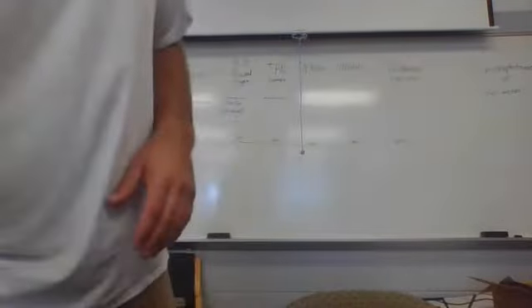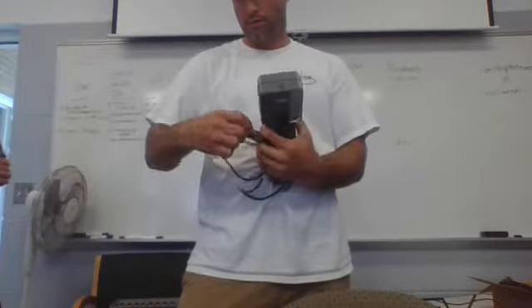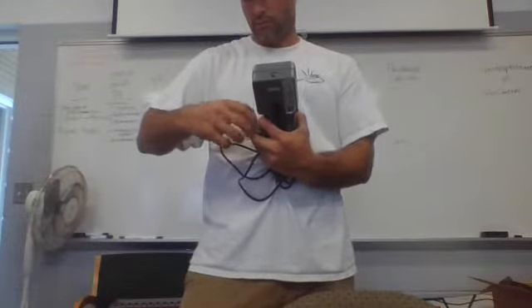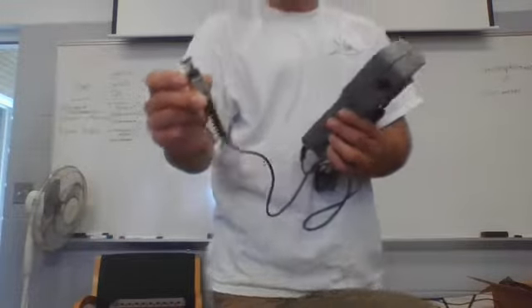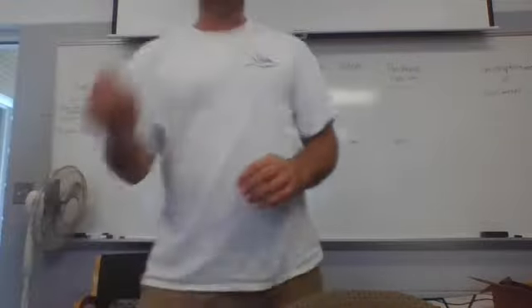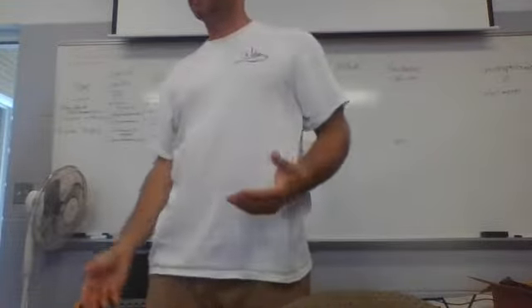This is an example of a newer model that has, under here, you put the solution, and then you stretch that membrane across it, and this is a little O-ring that holds it in place. So you can pass that around if you want. At some point I'll make you change the membrane, drive you crazy. Because if you get a bubble or a wrinkle or anything like that when you're stretching the membrane out and pulling that little O-ring over, you've got to start over.